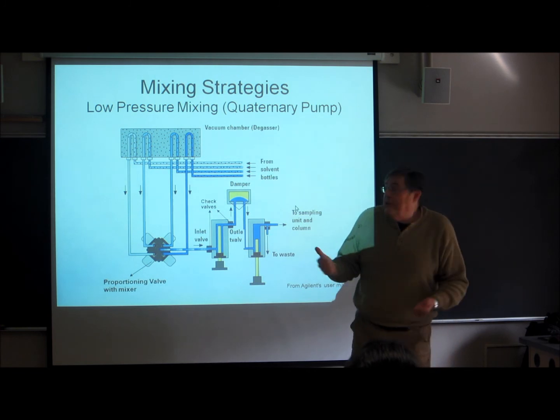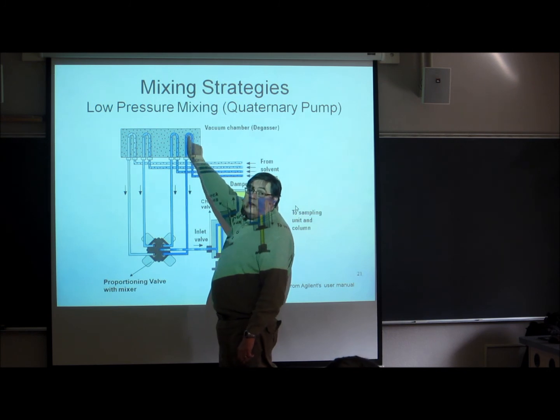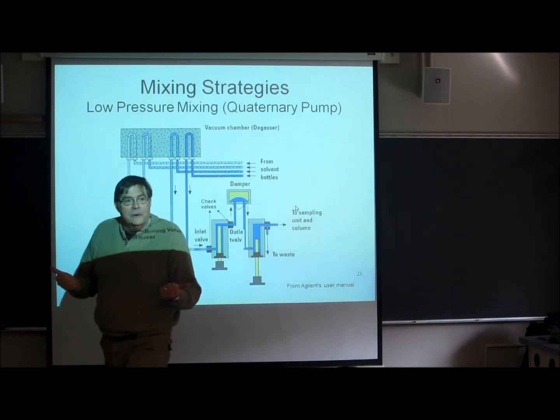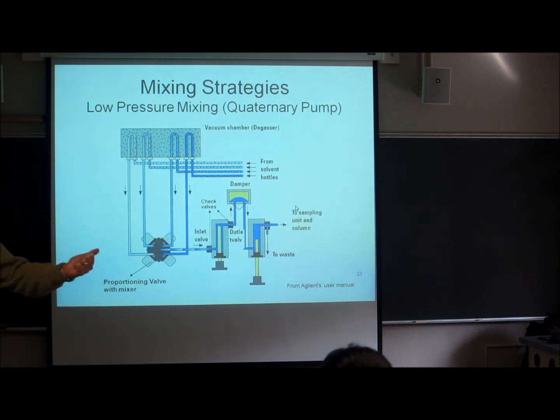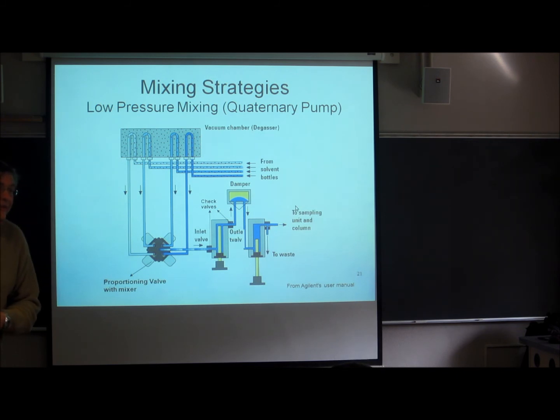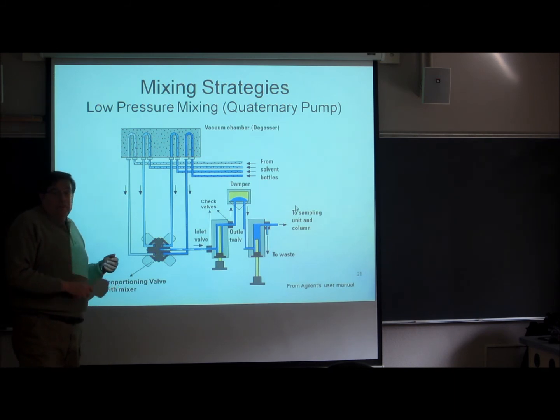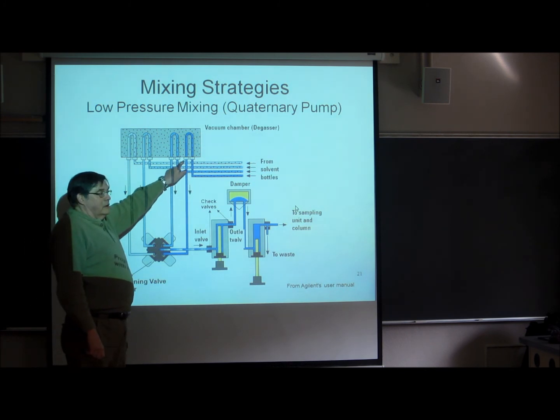Okay, so since this is low pressure on the outside, the gas pressure in the solvent is higher, and what happens? Henry's law, right? The fugacity increases and the gas comes out of the mobile phase. So this lowers the amount of gas in the mobile phase. I said a little bit about this last time. We have to avoid embolisms, and what can happen here is that you can mix 2 different solvents together, for example, methanol or acetonitrile and water.